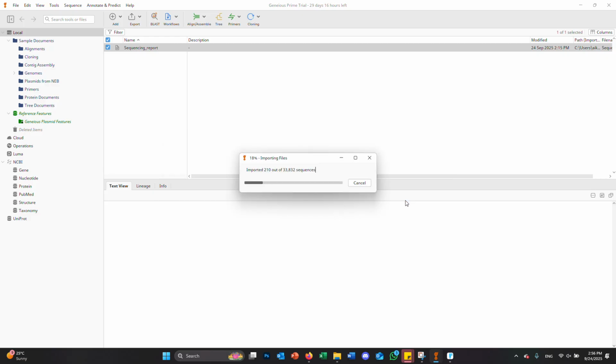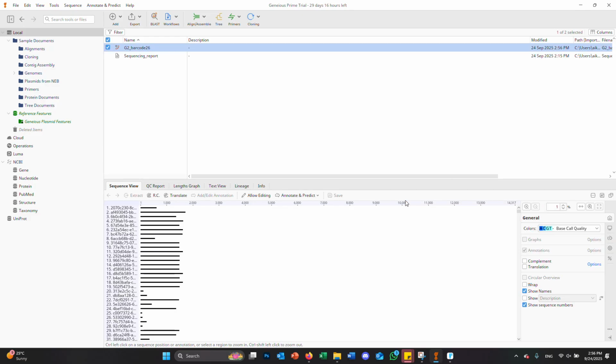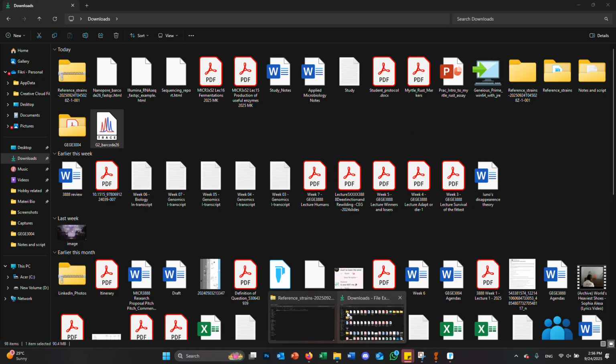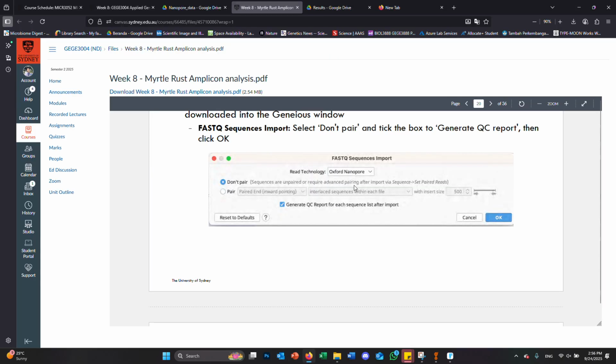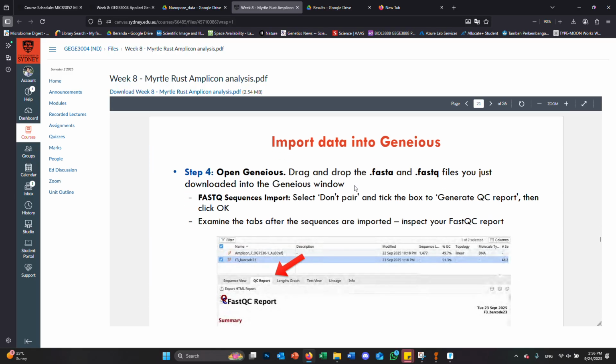I would suggest unticking including secondary alignments, so untick this box here. Don't trim. And I think everything else should be the same. You can save out an assembly report, and that report will just tell you how many reads in the amplicon actually mapped, and a few other things, and then save the contigs. So it's going to save the final output, and click OK.